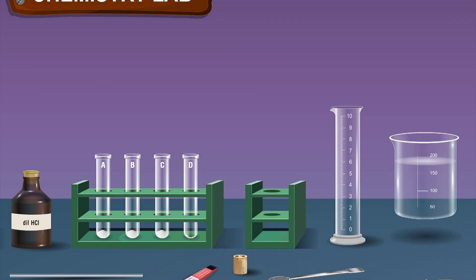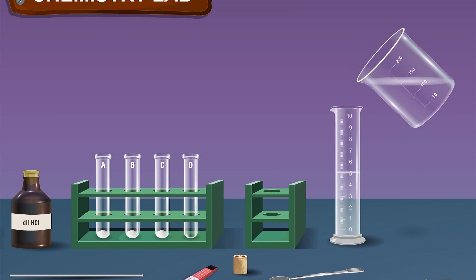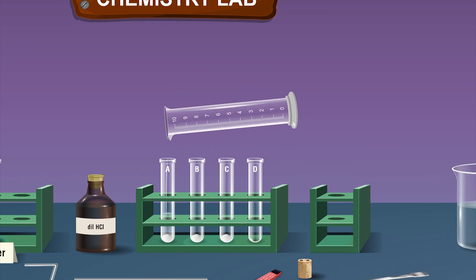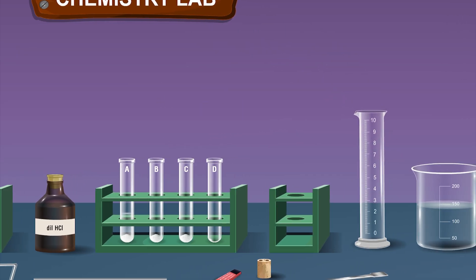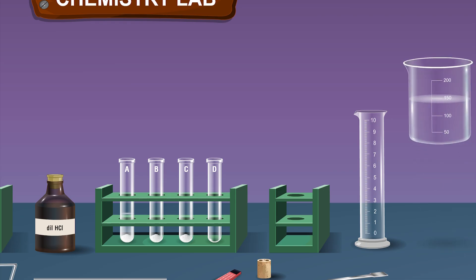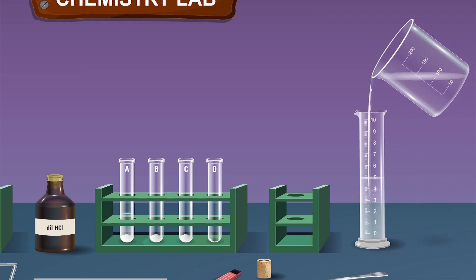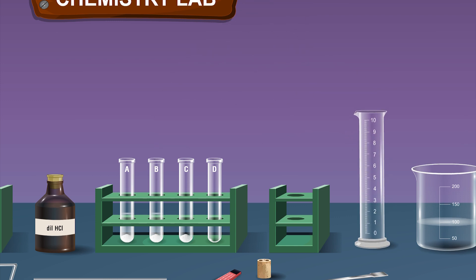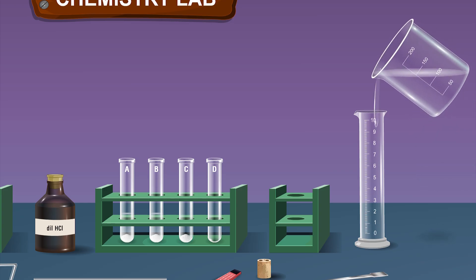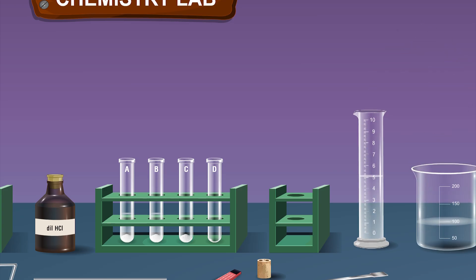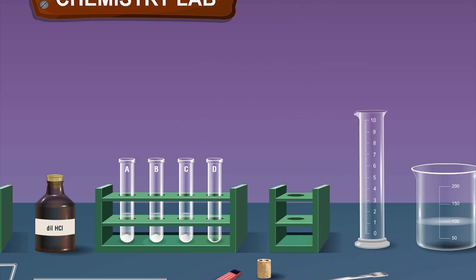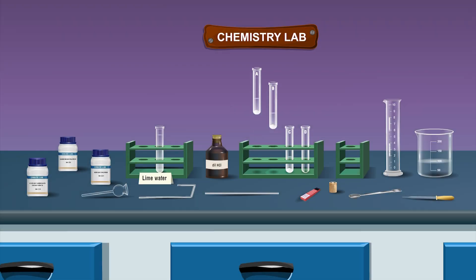Add 5 milliliters of distilled water to each test tube containing sodium carbonate decahydrate, ammonium chloride, and sodium chloride, and gently shake the test tubes.